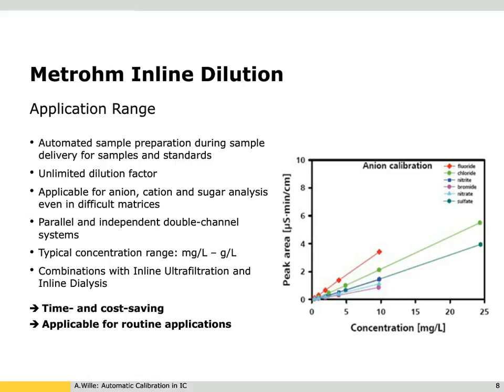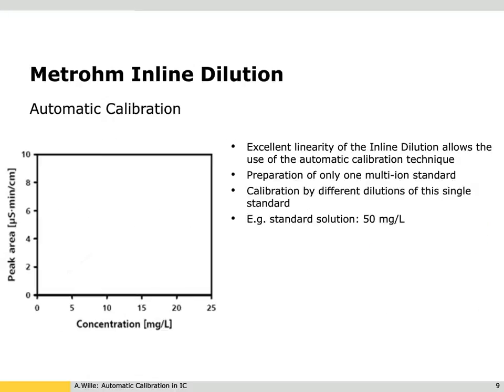We use this technique now for automatic calibration. Because of the excellent linearity of this technique, it is only necessary to prepare one multi-ion standard. And by different dilutions, automatic dilutions of this single standard, you get a multi-point calibration curve. Let's see here an example.